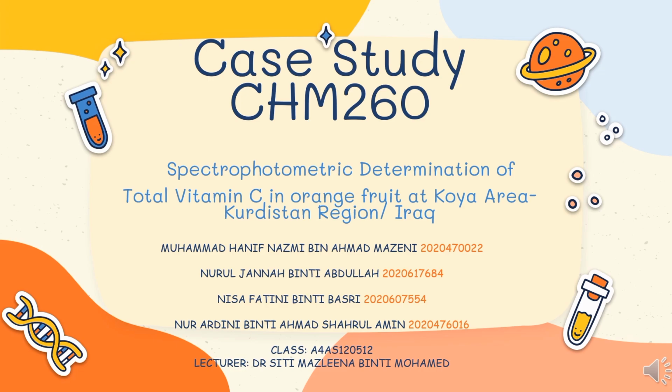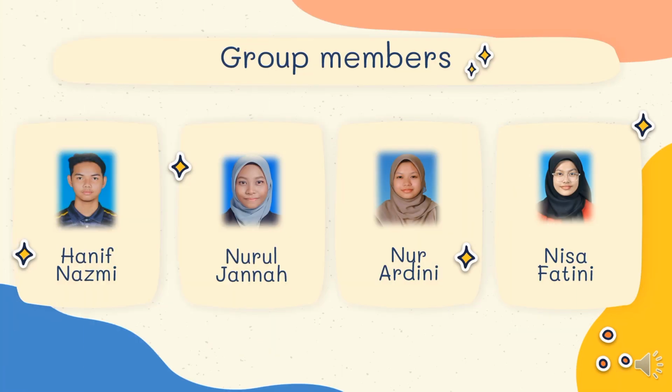Our title is Spectrophotometric Determination of Total Vitamin C in Orange Fruit at Koya area, Kurdistan region, Iraq. Our group members are Hanif Nazmi, Nurul Jannah, Ardini, and also Nisa Fatini.